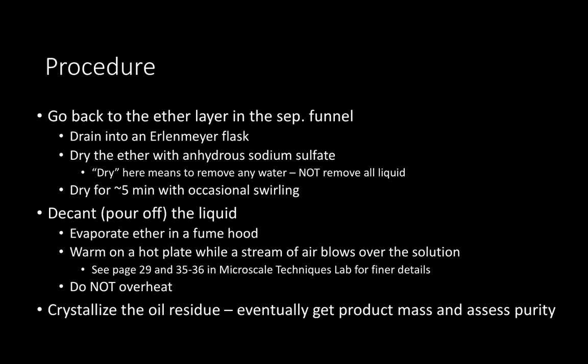What should be left is an oily residue. You can crystallize the oily residue — you may need to scratch at it and put it in an ice bath, and you will eventually get the product mass and assess its purity. I would recommend getting the mass of whatever container you are decanting into so you can simply subtract the container mass to get the crystal mass once your crystals have formed.